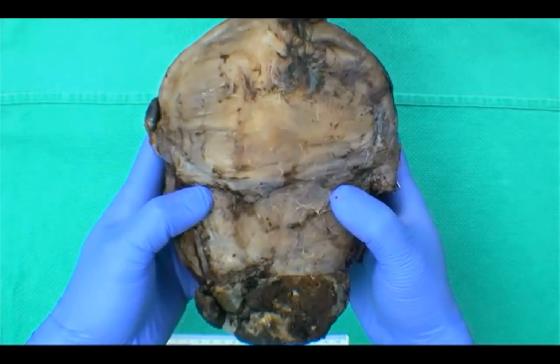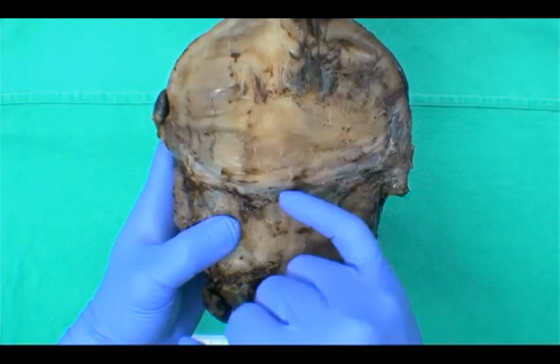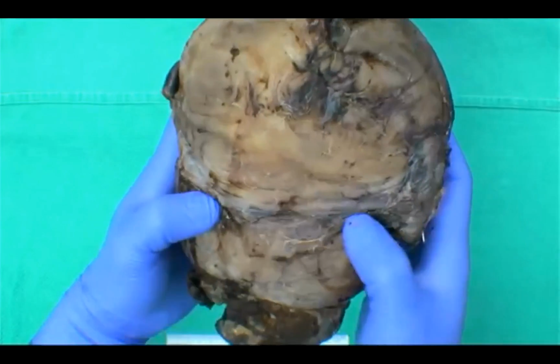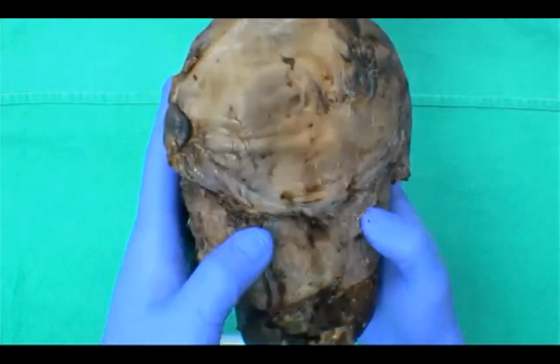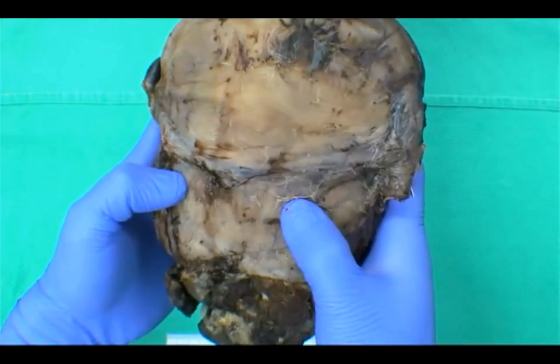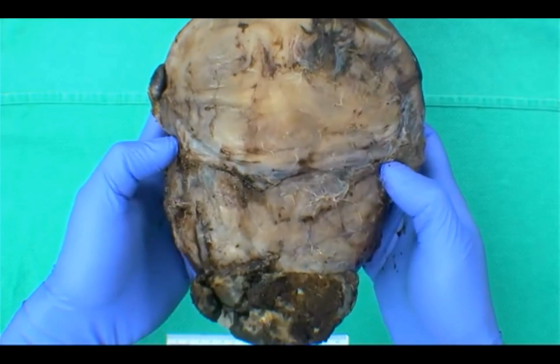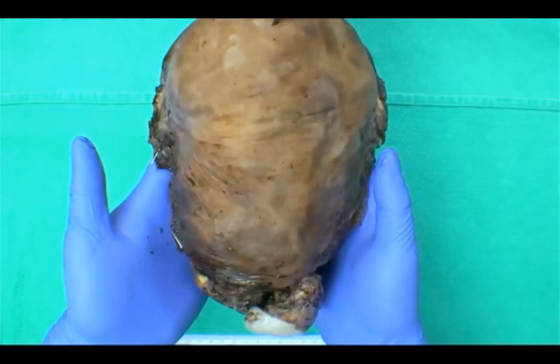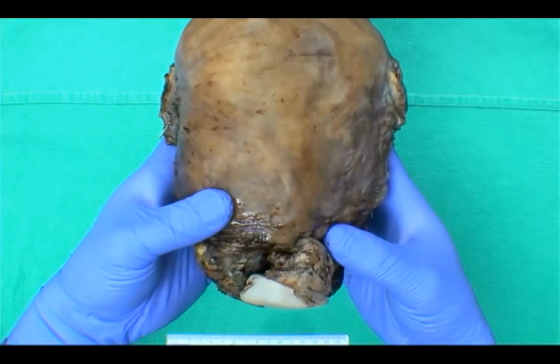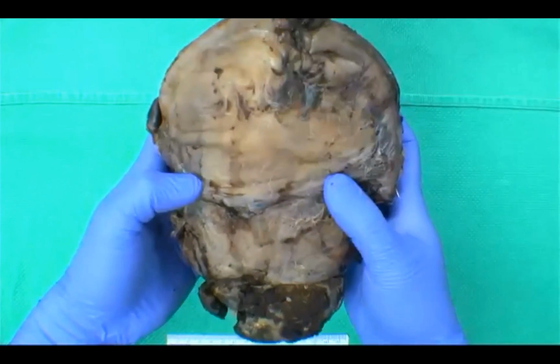Looking at the anterior aspect, there's a very nice clear landmark here, which is the anterior peritoneal reflection, one of the defining features of the anterior aspect of the uterus. It's a very useful landmark for identifying and orienting hysterectomy specimens. So we have a very nice example of it right here in comparison to the posterior aspect, which generally has a very smooth, continuous serosalized surface all the way down.